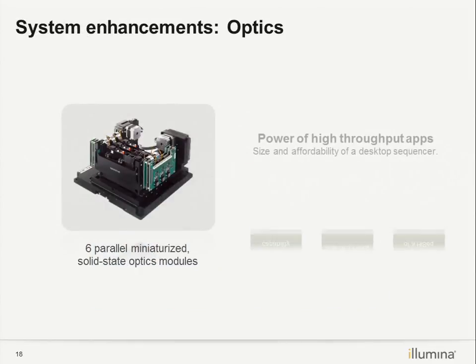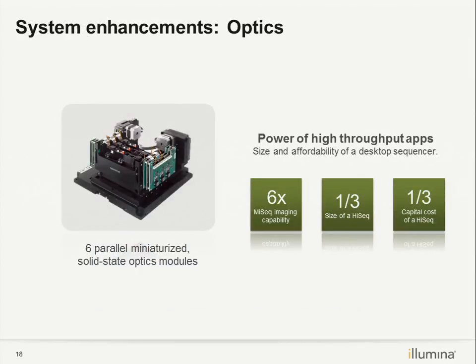Okay, so this is the optics, and that also means that if a single part of the optics has problems, there is no way that we can say camera 1 has issues. We cannot only replace camera 1, we need to replace the whole module of the optics. But I know you have 1 year's warranty, so don't worry if it's within warranty. But we don't have a lot of issues with that.